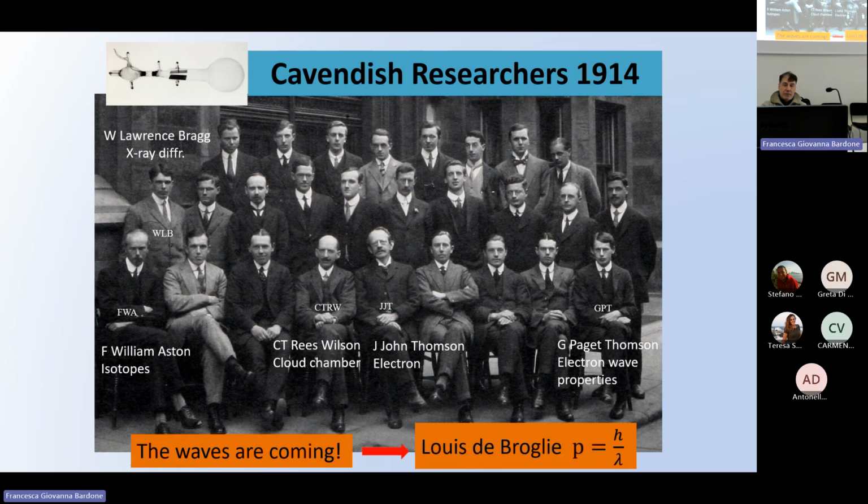So summarizing, it means that every particle can have a wavelength. And if every particle can have a wavelength, you can create optics with particles, because particles are waves.